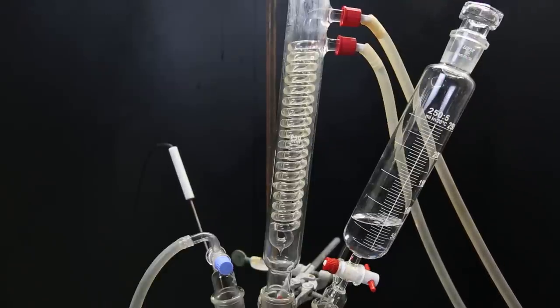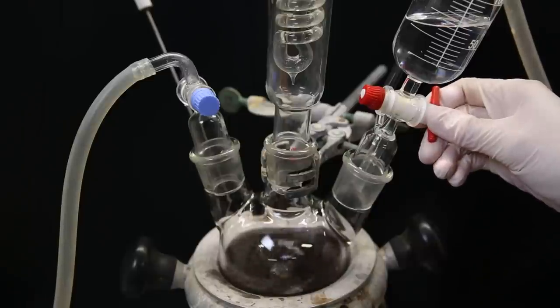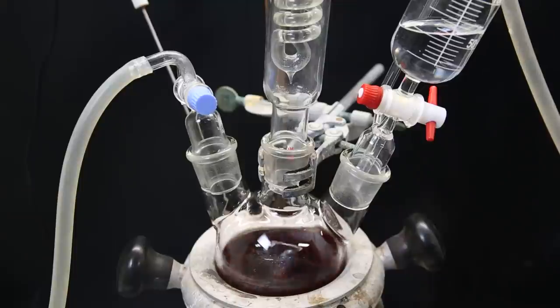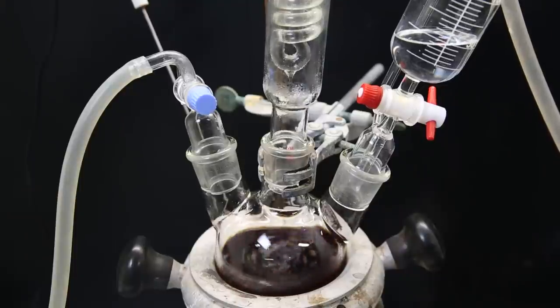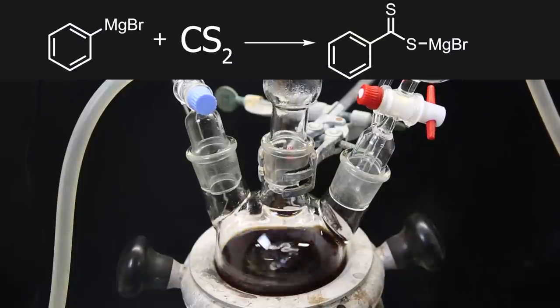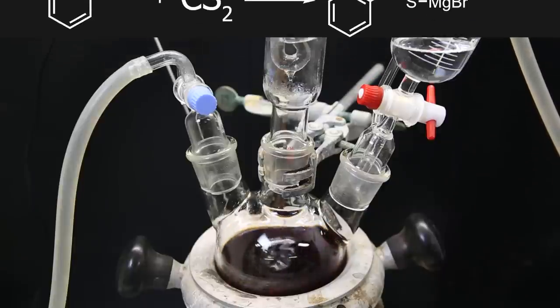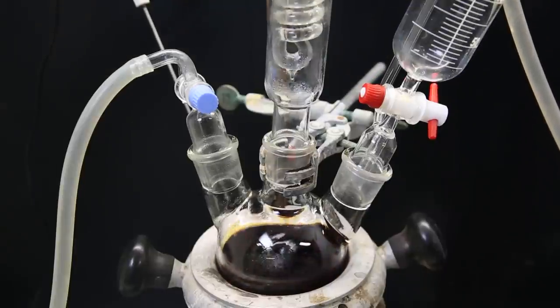I stop with the dropping funnel again, and then dropwise add the carbon disulfide solution to the flask. I increase the exposure of the camera, and we can see the mixture turns red during the addition. In the reaction, the carbon disulfide will react with the phenylmagnesium bromide, to form the magnesium bromide salt of dithiobenzoic acid. When the addition is complete, I leave it to stir for an hour.